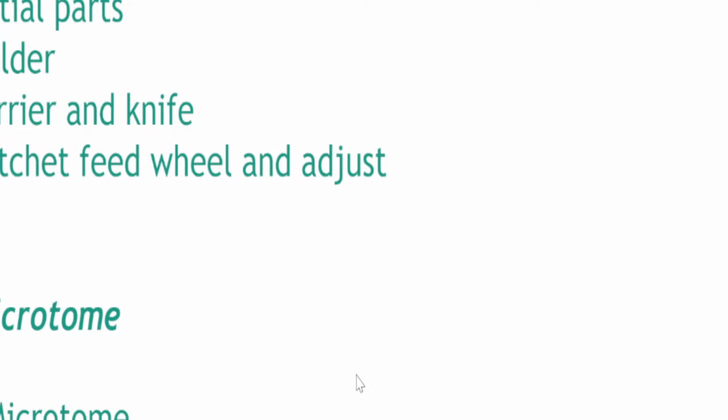Okay? Pag tinitrim natin. Yung pawl naman, sir, ano yung pawl? Kaklase ba yun na si Paul? Meron ba kayong kaklaseng Paul dyan? Okay, so ano naman yung pawl? Yun yung malaking wheel na ginaganon natin para akyat baba yung tissue section. Okay? So clear tayo doon, class, ha?